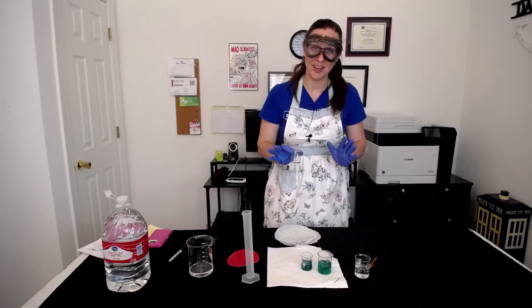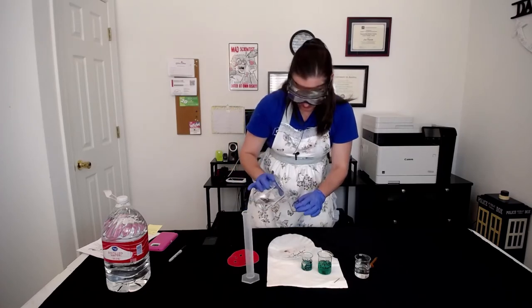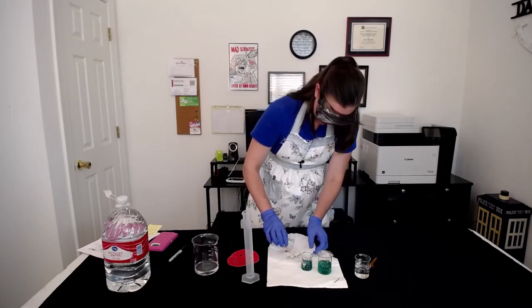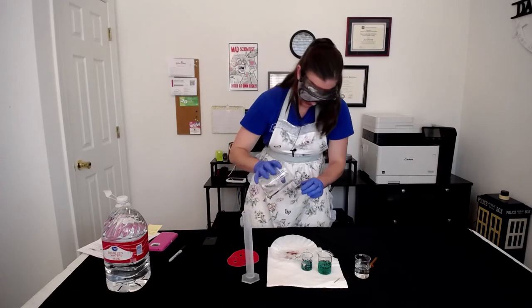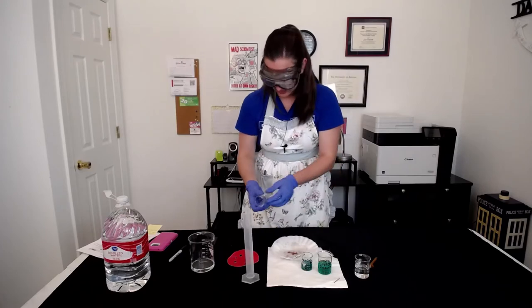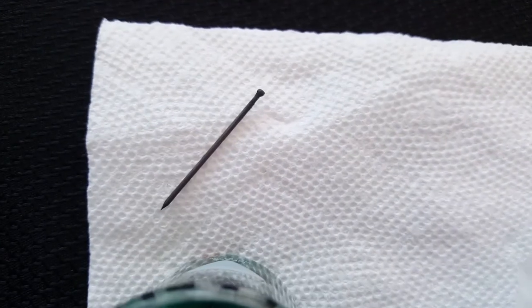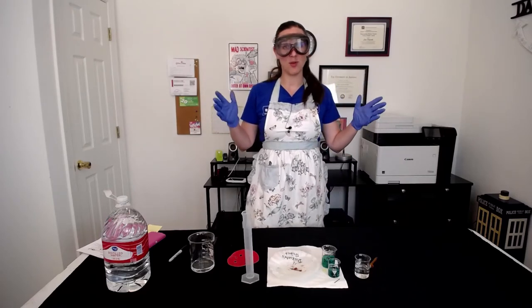When you decant, it's okay if there's a little bit of liquid left in the bottom, so long as you haven't lost any of your solid product. The reason this is okay is because we're going to put it on the filter paper anyways and let it dry. I'm going to add just a little bit of water to help remove our copper product from the bottom and get it onto our filter paper. Now that all of our product is on the filter paper, we just have to wait for it to dry. Once it's dry, we'll take its final mass along with the final mass of the nail, and do our calculations with those values. So let's wait 24 hours for this to dry, and we'll mass it so we can do the calculations.